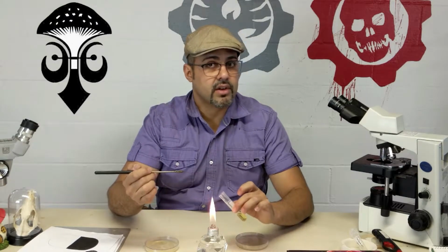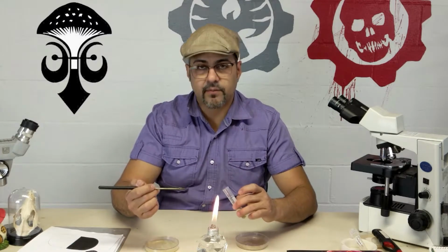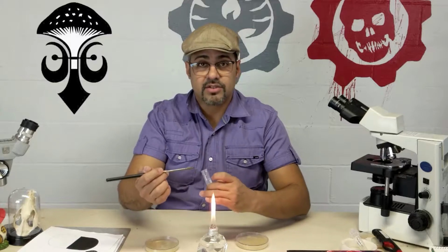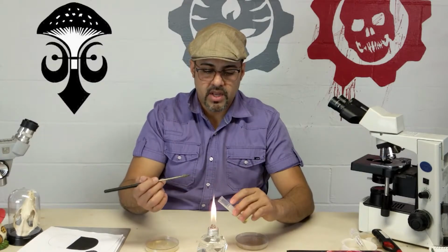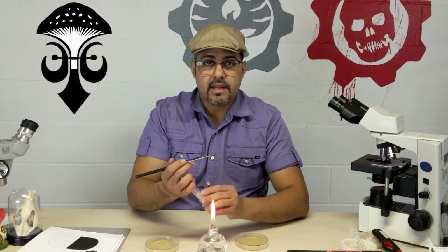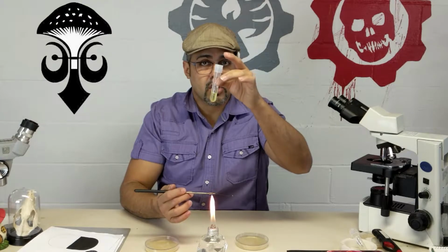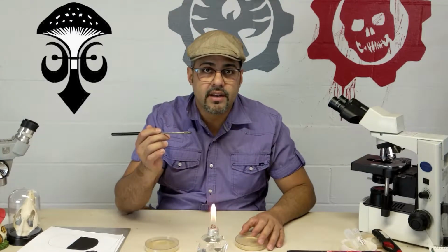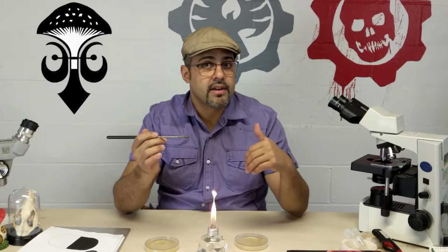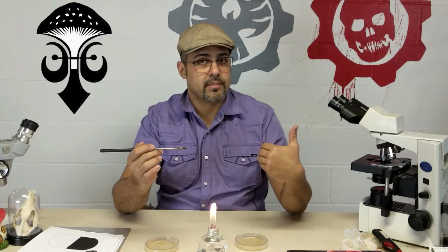Not close enough that you can burn it, but let's say like 4 to 6 inches from there, because this area is actually warm. If you put your hand there, you feel that it's warm. So after that, with your pinky, the cap that you have in your pinky, you close the culture, put it in your rack. Then now you're ready to either transfer into a tube or to a plate.